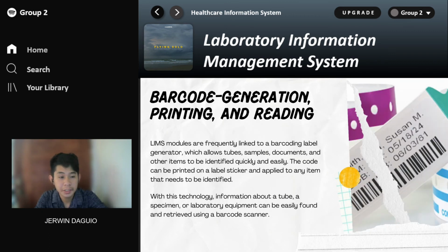Barcode generation, printing, and reading. LIMS modules are frequently linked to a barcoding label generator. The barcode may be put on a label sticker and stuck on any object that requires identification. With the use of this technology, you can quickly locate the samples required for the procedures. Using the barcode scanner can also assist us in retrieving the samples needed in the operation.